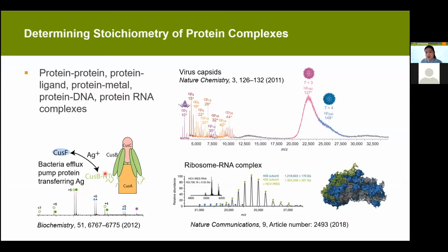under non-denaturing conditions. The two examples on the right are actually from Professor Abraham's group. The first one is looking at virus particles, and the other is looking at ribosome RNA complexes.